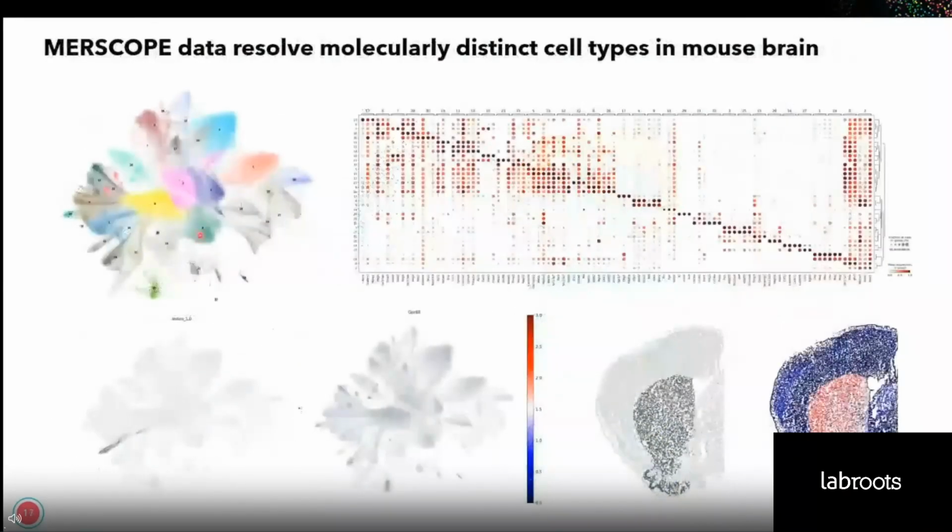So for downstream analysis, I combined all the cells from 17 samples, got almost 1.8 million cells. The first round of cluster analysis revealed 34 cell clusters, which exhibit distinct gene expression patterns, as you can see here. By combining both gene expression and spatial information, it's relatively easy to annotate cell clusters.